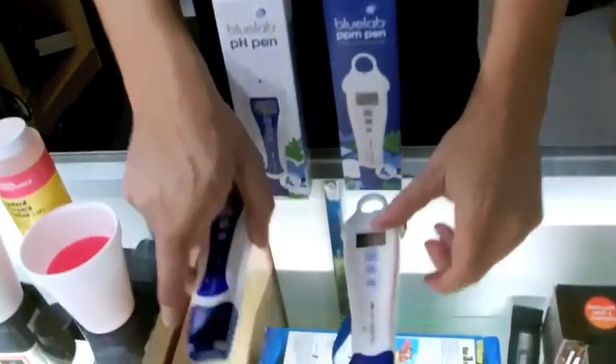The pH pen, however, you want to calibrate once you get it. And it's super easy, super simple to calibrate and I'm going to show you how real quick.